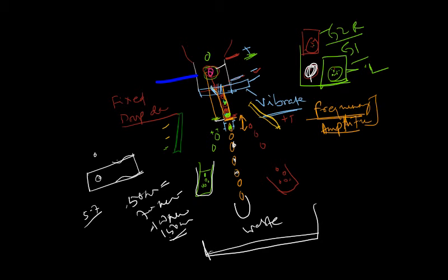How we compute the drop delay and how different instruments handle it, I will talk about in a separate class altogether. Here, what you need to understand in a very simple way is that as the cells are illuminated, the detection happens. After the detection, the decision is made whether to sort the cell and in which direction it would be sorted, and the undesired cells are not. Then deflection, and finally collection. So: detection, decision, deflection, collection.